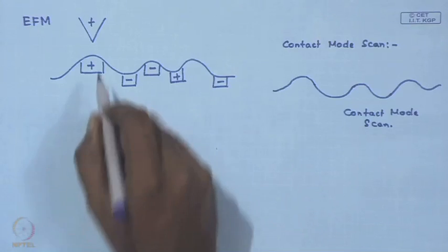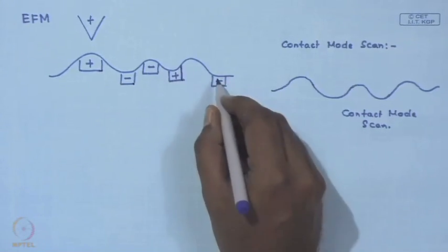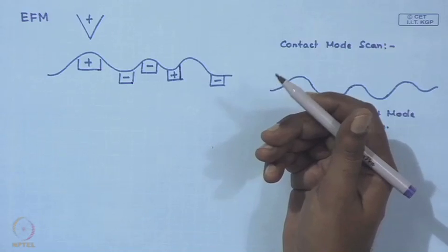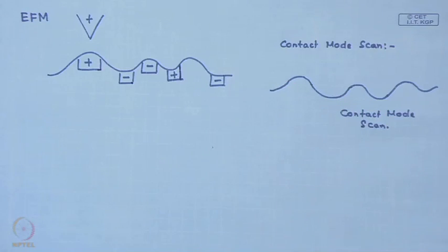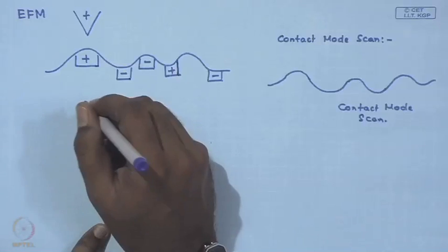And please understand, these are differently charged domains, so they might not have a direct significance on different adhesion or friction properties. So, the phase image might also be very blunt, it might not be able to pick up. So, what is typically done is, along with the bias turned on, you typically would do a non-contact scan also.